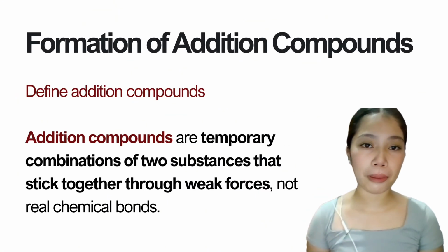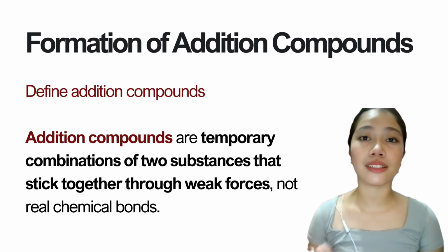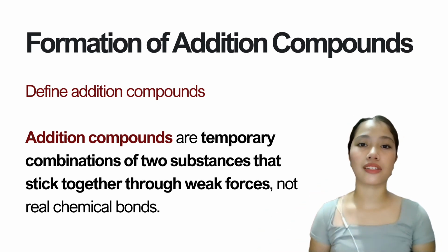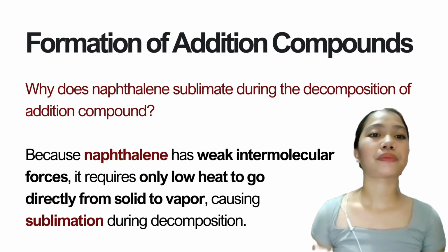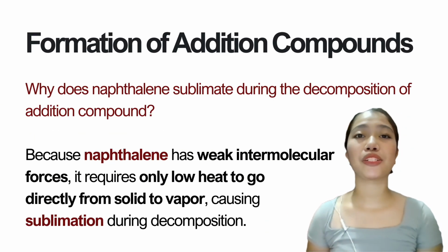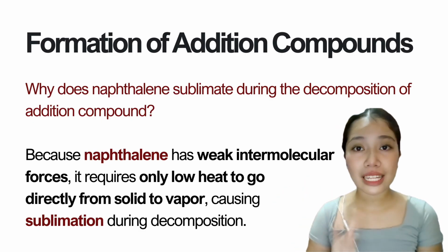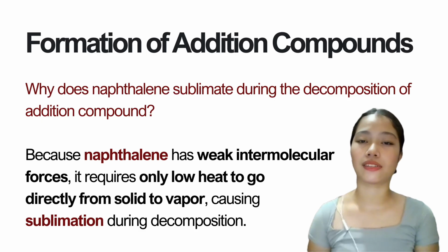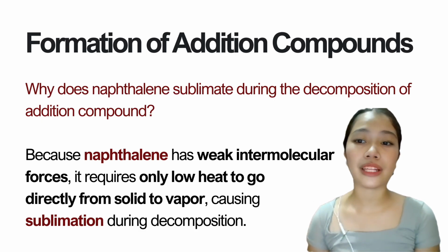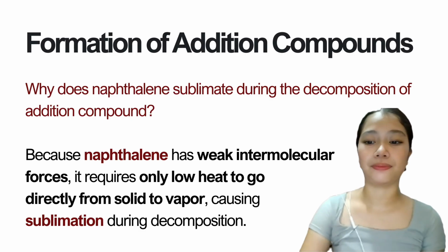Define addition compounds. So addition compounds are the temporary combination of two substances that stick together through weak forces, but not real chemical bonds. So next. Why does naphthalene sublimate during the process of decomposition of the addition compounds? So naphthalene sublimates because it has weak intermolecular forces. So it only requires low heat to go directly from solid to vapor, which causes sublimation.